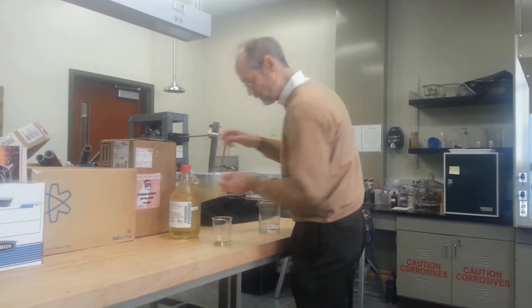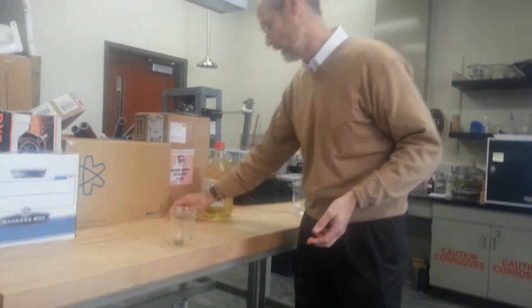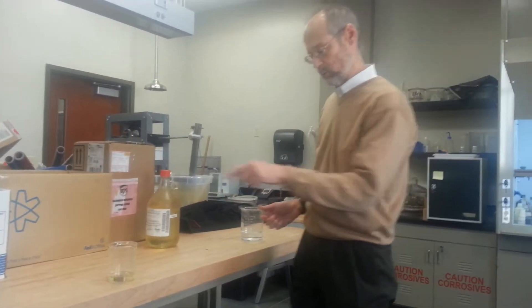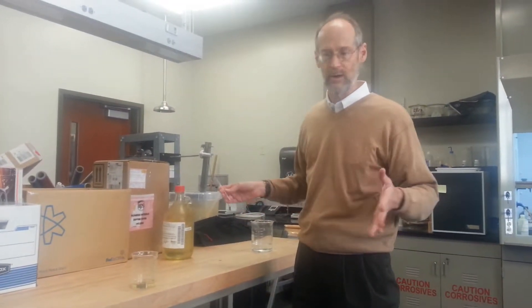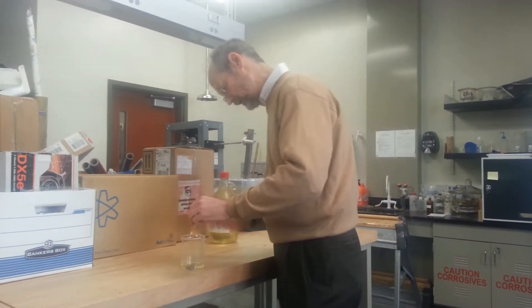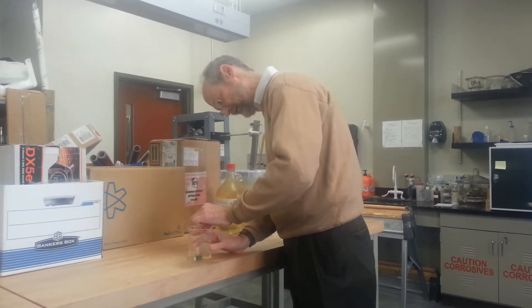And now you see — what you essentially see is nothing. There's no reaction going on, and really if we were able to measure the reaction rate between the acid and the steel, we would find out that there's essentially no chemical reaction taking place. It's taking place at a negligibly slow rate, and if I go in with a glass rod and scratch the surface, I see that nothing happens.